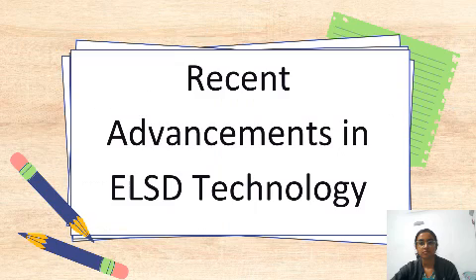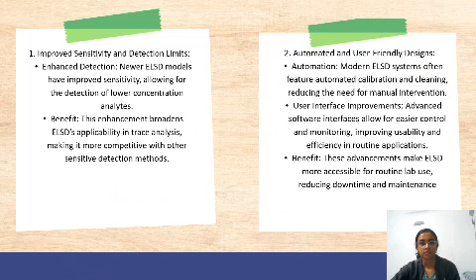Let's see the recent advancements in ELSD technology. First one is improved sensitivity and detection limits. Enhanced detection: newer ELSD models have improved sensitivity, allowing detection of lower concentration analytes. This is beneficial for broadening ELSD applicability in trace analysis, making it more competitive with other sensitive detection methods.